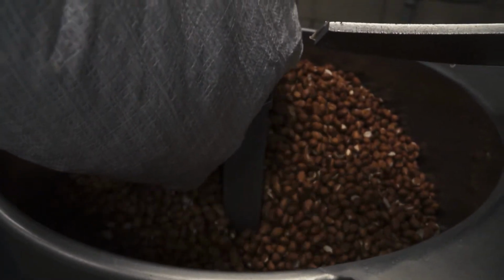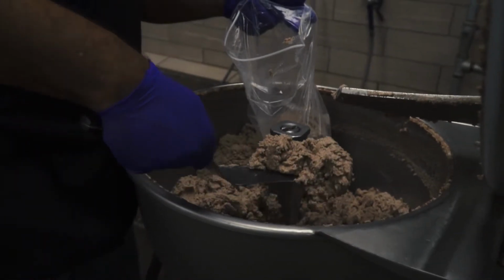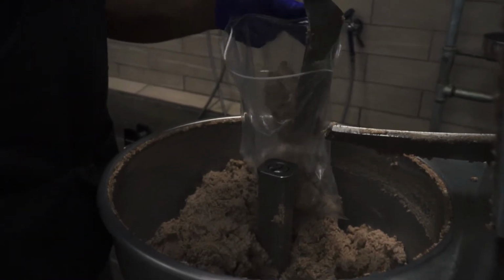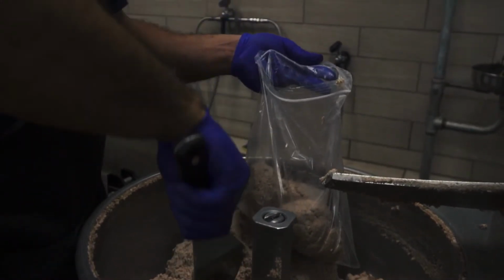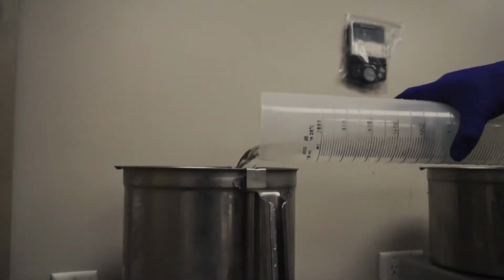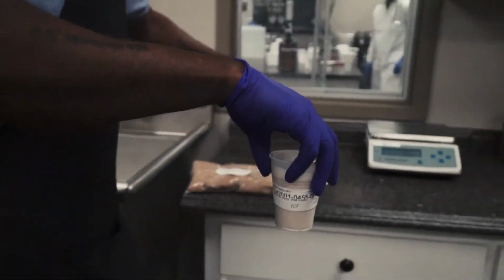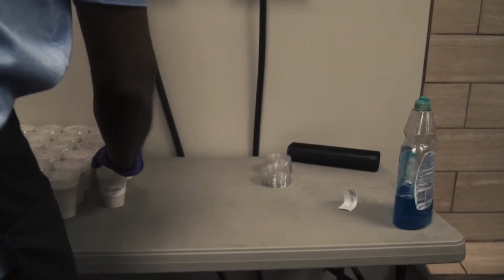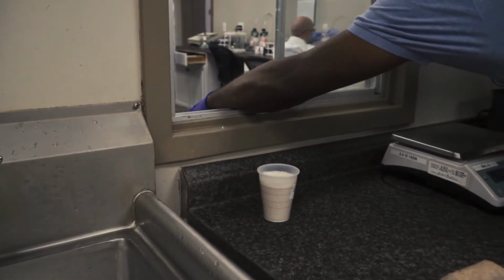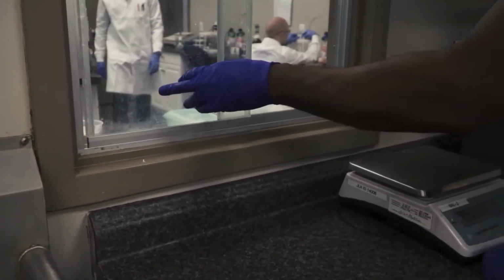Sample preparation begins as peanuts are poured into a vertical cutter mill and ground until they become a homogeneous paste. 900 to 1,300 grams of paste are taken from the predetermined locations in the bowl, and the peanut paste is weighed to determine the amount of water needed to make the peanut water slurry. A duplicate sample is retained until the sampling process is completed. The sample and its corresponding paperwork are passed from the sample preparation area to the lab for testing.